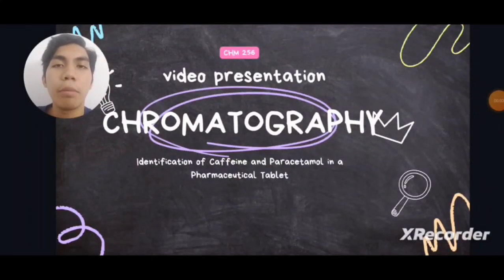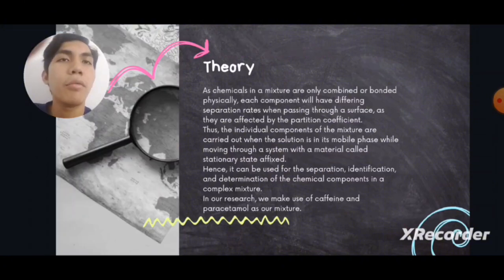My name is Afiq Dania bin Zaki, student ID number 2022-497-654. For our video presentation in CHM 256, we will be showing you about chromatography. Our title is the identification of caffeine and paracetamol in a pharmaceutical tablet. We will be referencing Panadols, which are usually used as painkillers. Let's begin with the introduction.